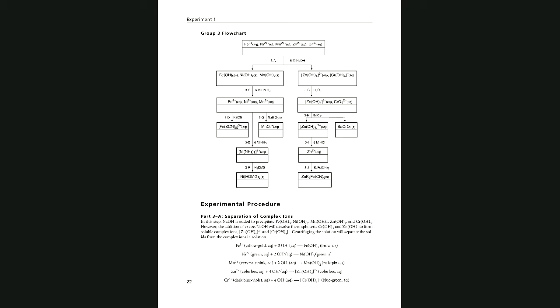Not all of them is going to be present, of course. Sometimes they tell you the maximum how many you have. So if you know you have like 3, then when you find 3 for sure and you're confident about it, then you can even stop.